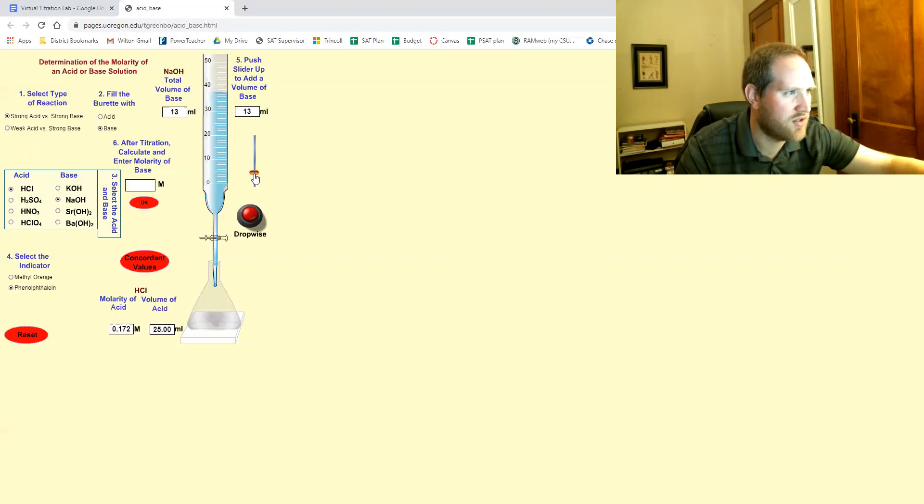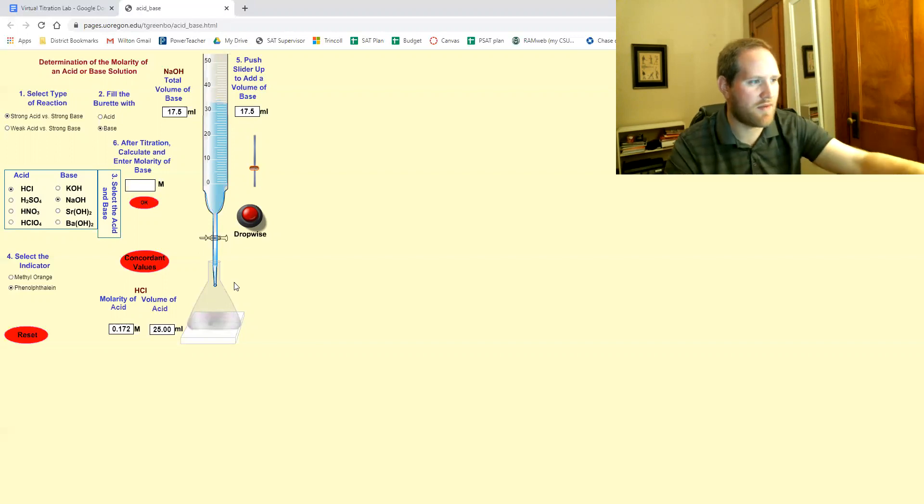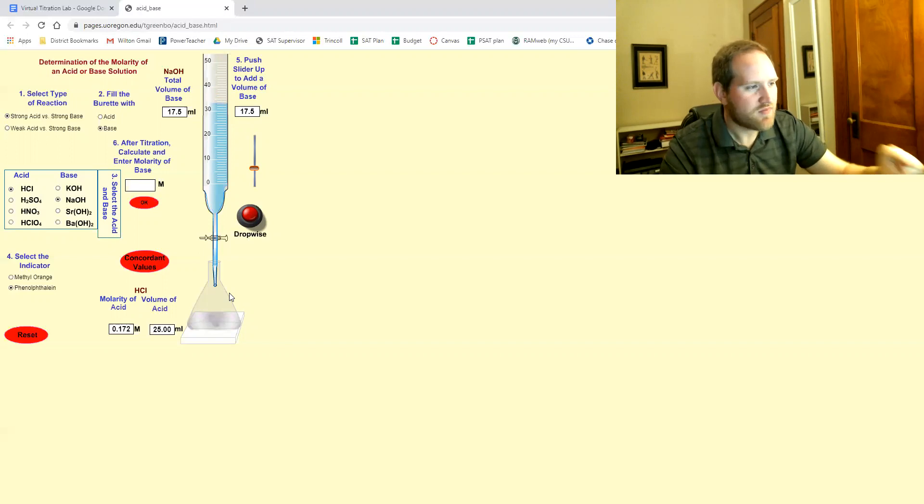Okay. No color. Let me go to like 15 or so. 15. No color. Let me go to around 17. Oh, see that little flash of pink.